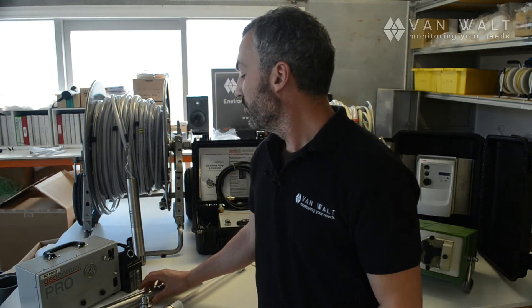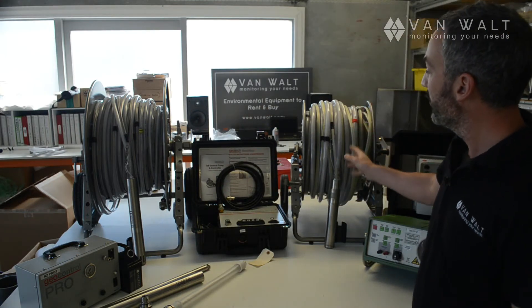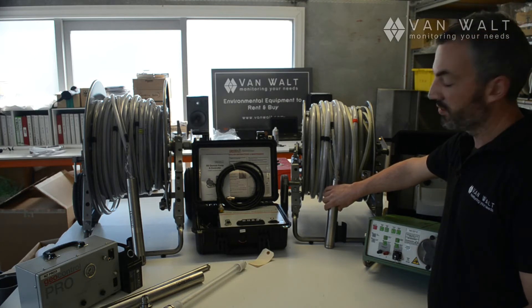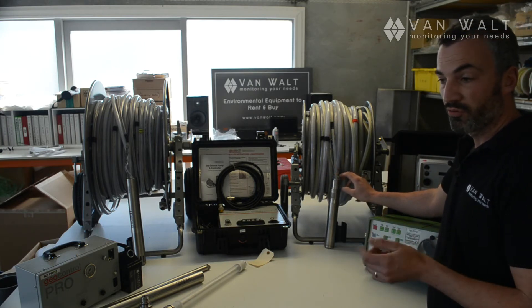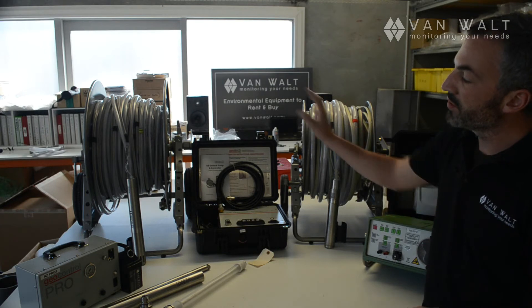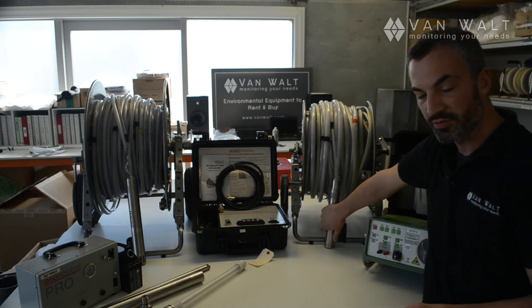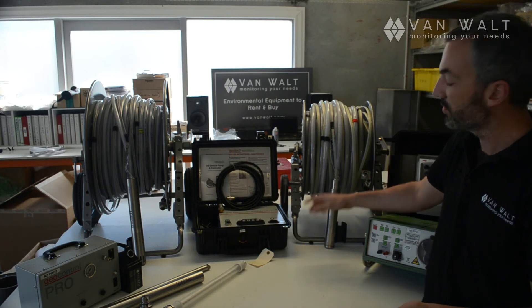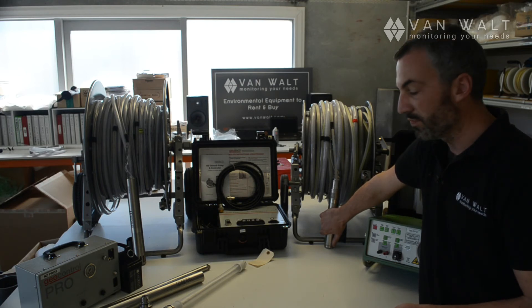Now moving on to the high flow pumps — the geo sub pump and the MP1 pump. Starting with the MP1, this is the only pump of this diameter that will high-flow purge at really low depth, down to a maximum of 90 metres and a maximum flow rate at 1 metre of about 36 litres per minute. There is another video comparing these two pumps, so I'll keep this short. One fundamental limitation is the heat that it generates — both pumps generate heat to a degree, but the MP1 can generate quite a lot of heat and has the potential to affect your water sample.